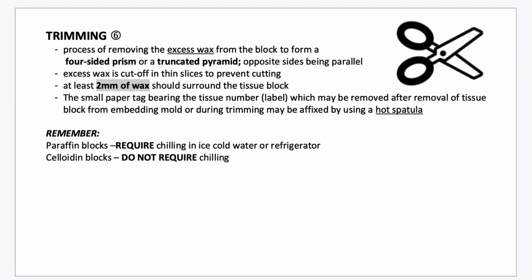So, always remember, paraffin blocks require chilling in ice cold water or a refrigerator, and celloidin blocks do not require chilling. Okay, that's it for this video.